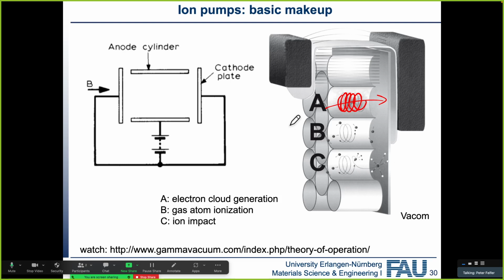For us in atom probe tomography, they also have one additional downside, and that is some of the ions typically can escape and can get sucked into our detector. So we need to have some good shielding in order for the ions not to get sucked into our detector.